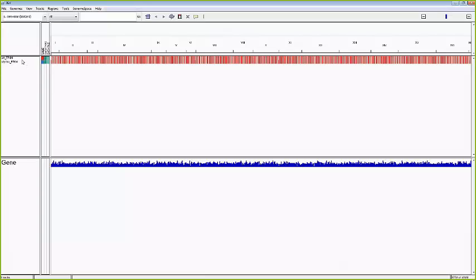So I can see here that this genes.gct file has the wild type expression and also the expression for the knocked out samples. Red indicates presence of expression, white indicates absence of expression, and we'll zoom in on that later. This is the gene annotation information for the reference genome.